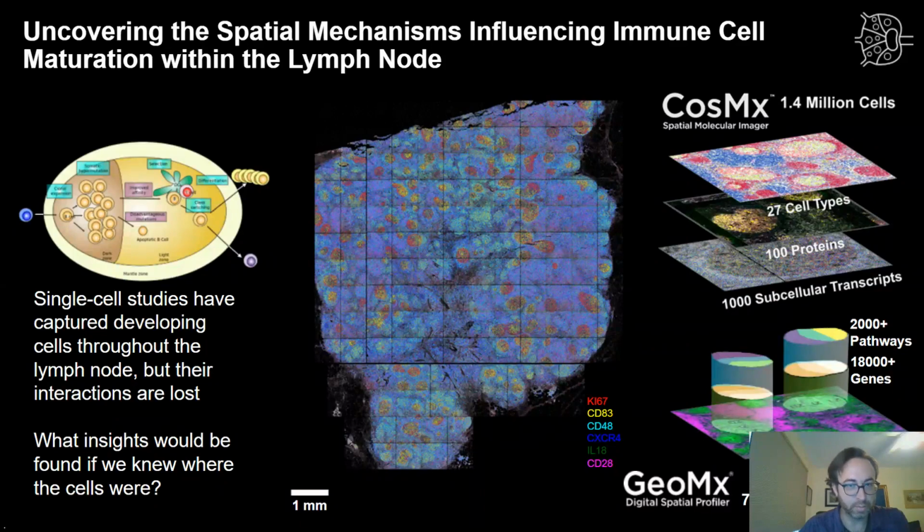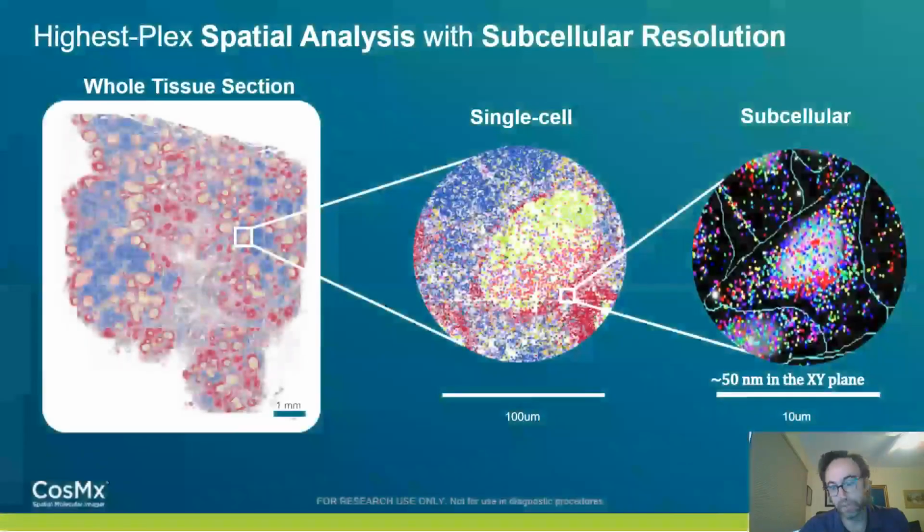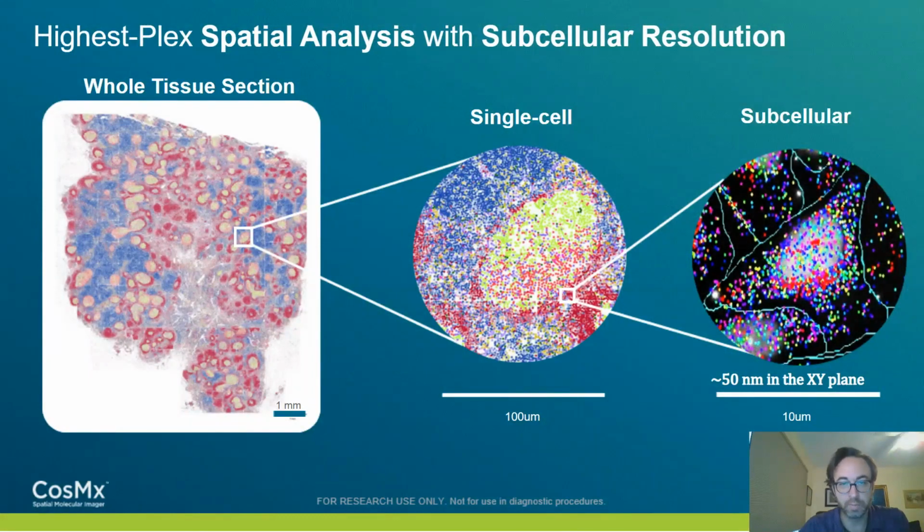Now, I say this, but I want to really emphasize that one thing that we spend a fair bit of time on with our systems is making sure that we're getting robust data. And so I showed you that previous slide that showed the lymph node sample as individual genes. This is showing it on the left as cell types, colored differently by the cell type that's assigned.